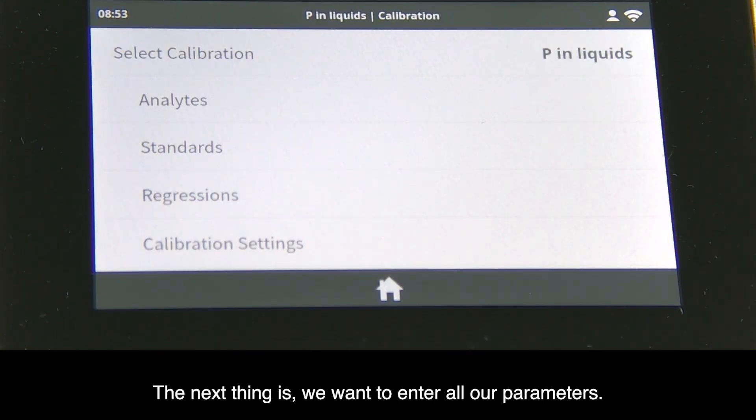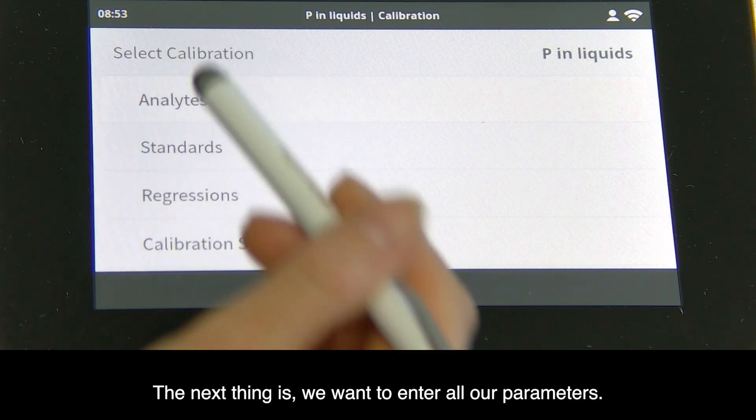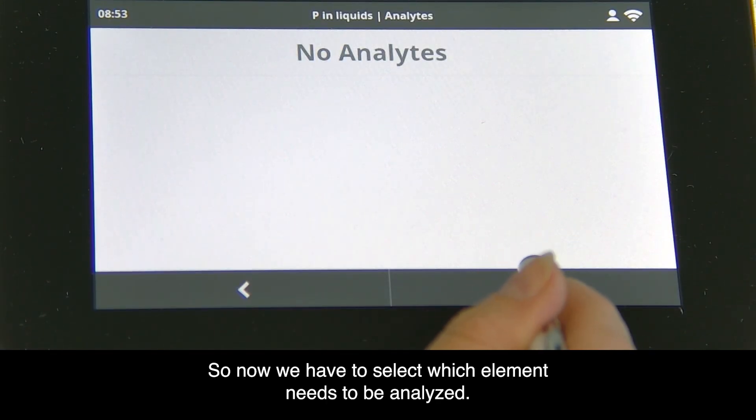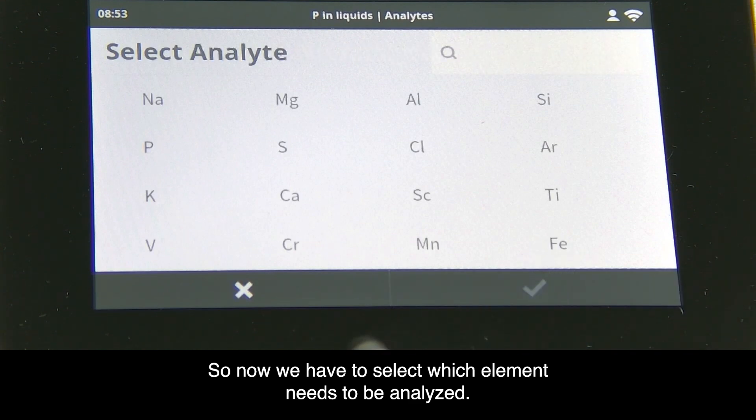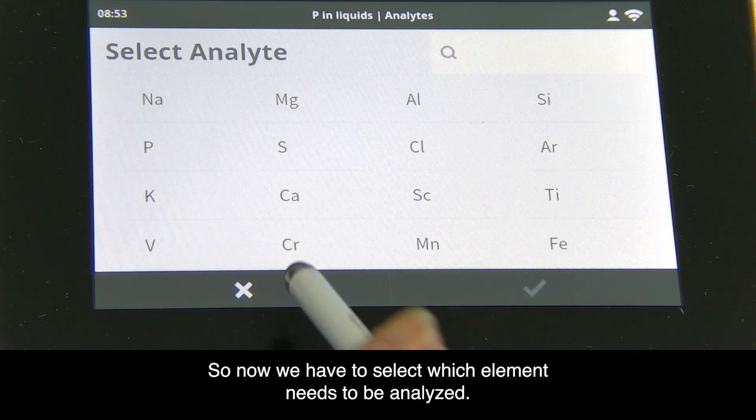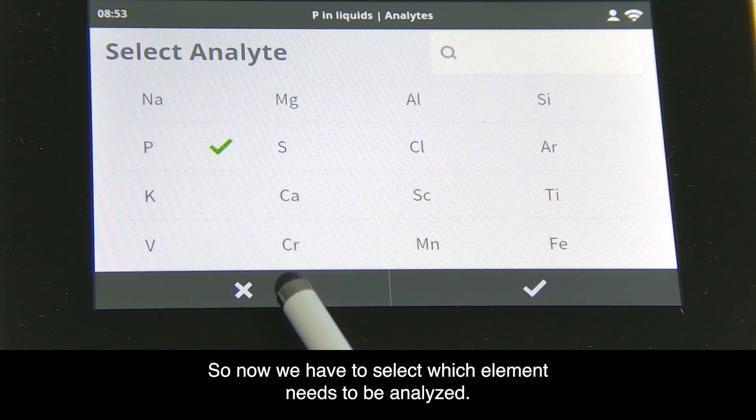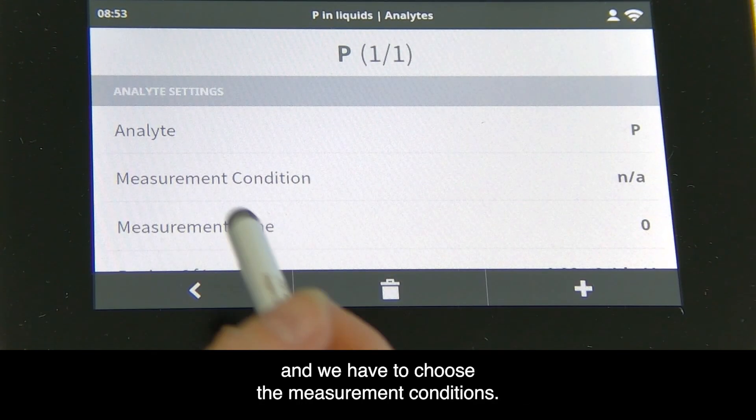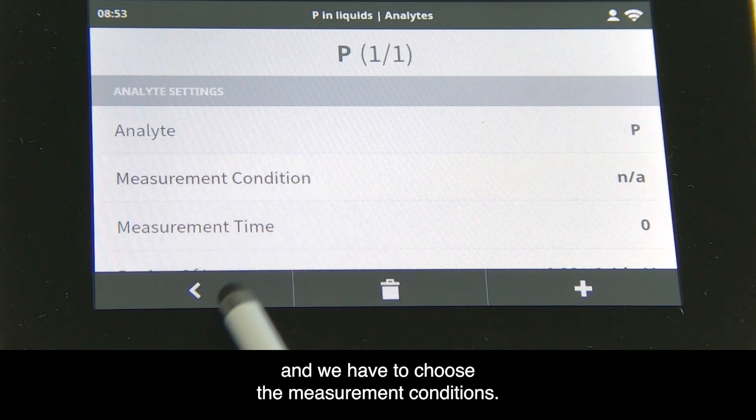The next thing is to enter all our parameters. We need to select which element to analyze - we want to analyze phosphorus. Then we choose the measurement conditions.